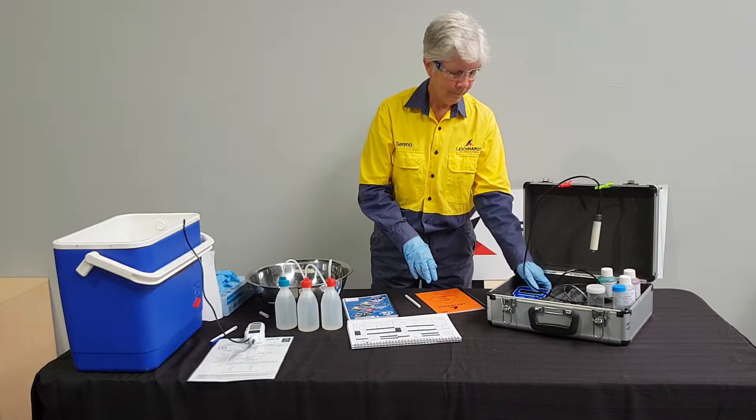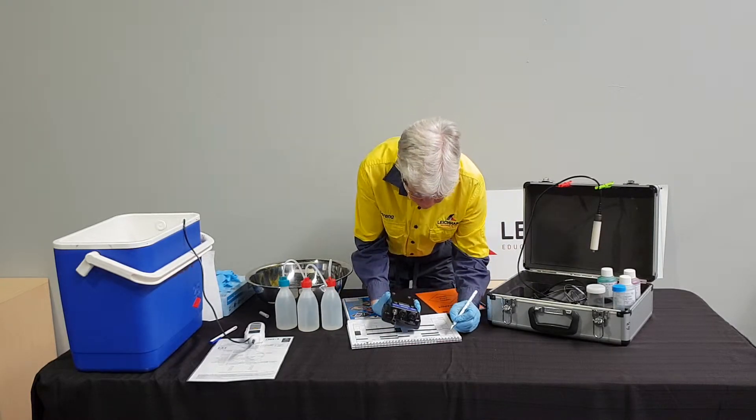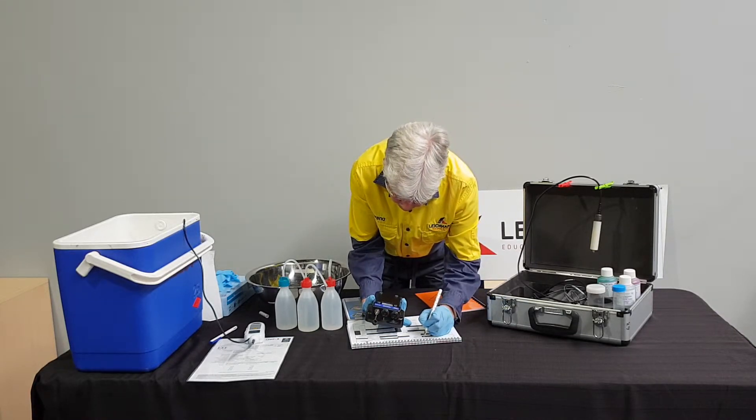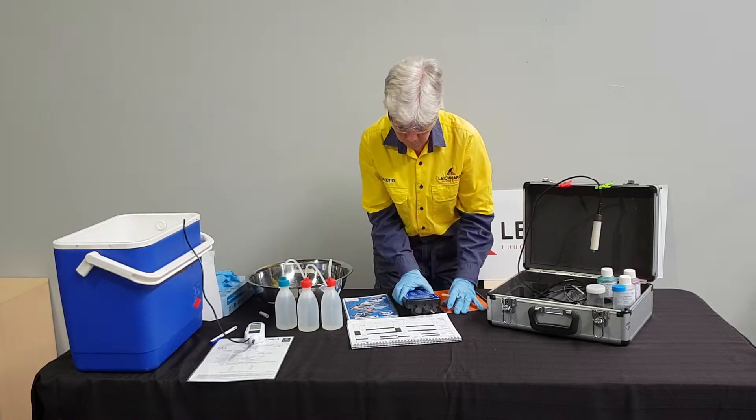Serena is now going to record the date and instrument serial number on the top of the record sheet. She will also record the serial number of the certified thermometer.